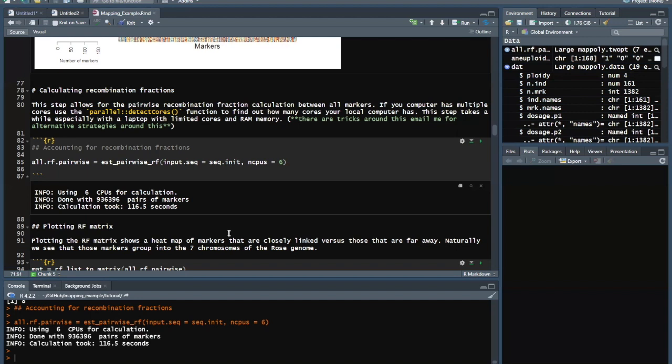I mean, you could do that, but that's way further upstream than here. You would do that before you even get into the mapping. What I was asking is if the software can take into account that information. Correct me, Gabriel, if I say something wrong, but I think MapPoly already filters markers that are missing in the parents. When you go into the software with your data, if you have missing data in the parents, MapPoly will discard the marker. Correct. Thanks. That's exactly what I was asking.